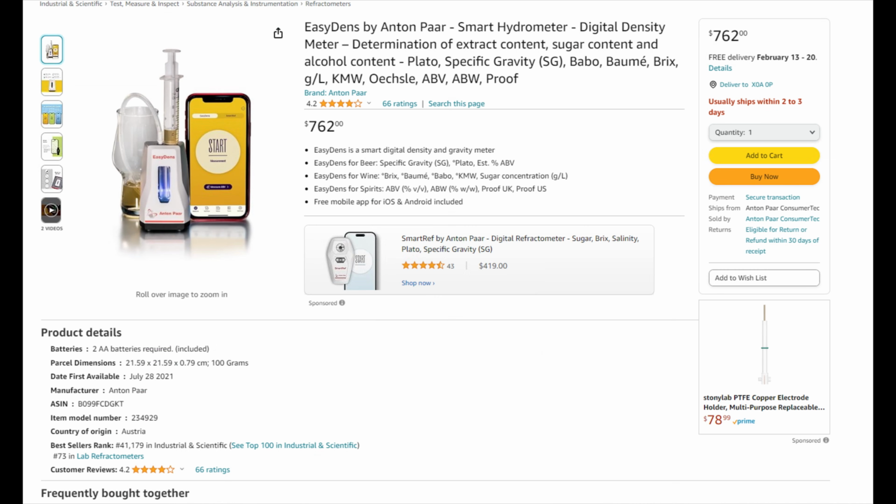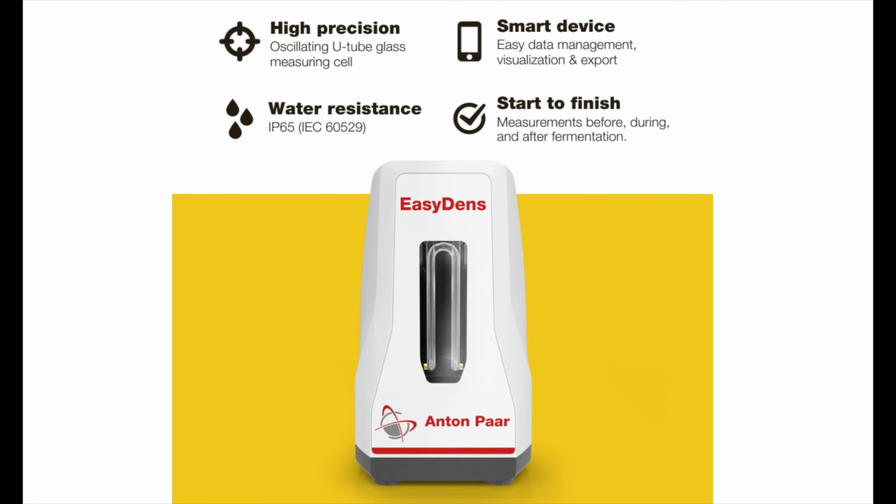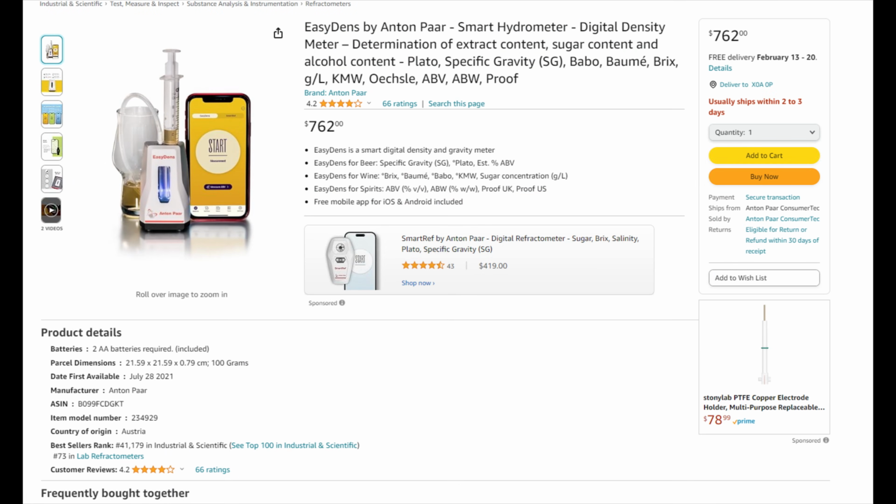Okay, big correction, I'm editing this in from the future, and I came across an actual domestically available U-tube density meter on Amazon. You can even see the U-tube right in the picture. So I'm wrong, you can indeed buy one as an amateur now. This seems to be advertised as assisting with the brewing of alcoholic beverages.